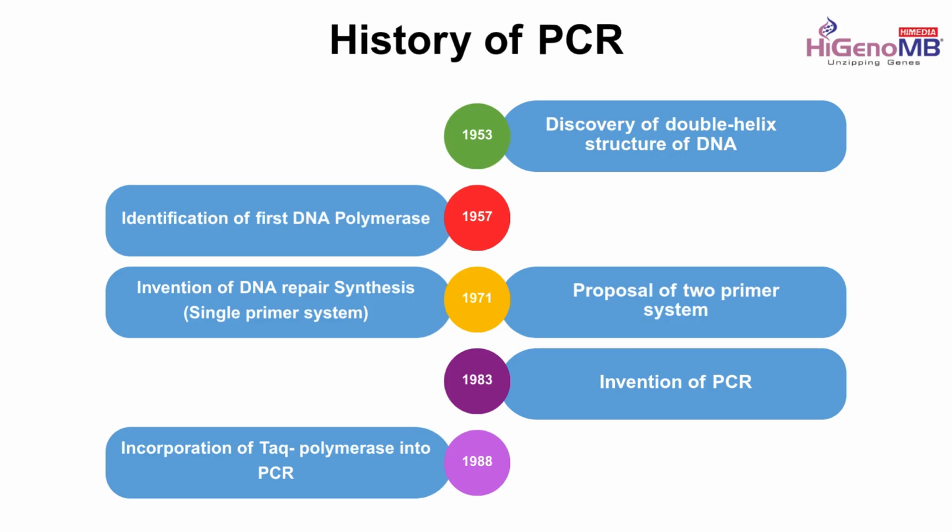But the DNA polymerase used in the olden days was not thermostable, meaning after one cycle of PCR is done, it loses its activity. So after each cycle, a fresh DNA polymerase was added. Just imagine, after each cycle, after 1 minute, you open a tube and keep on adding a component inside it. This was painstakingly difficult, and it was very laborious.